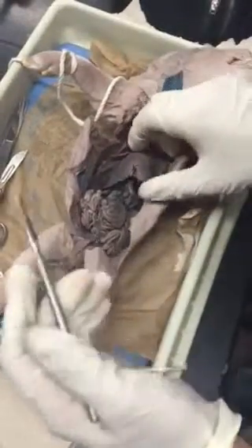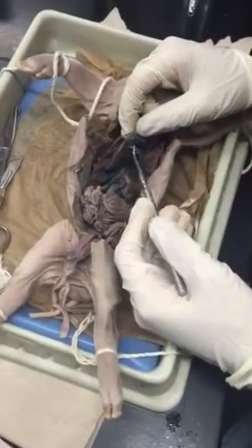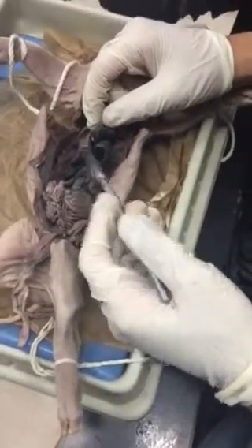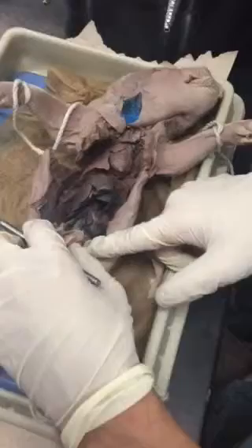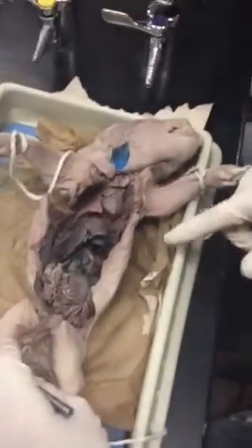Okay, so this little part right here, that's on the liver. Can anyone see that? Yes. This part was cut, but it used to be connected to this part right here, and it's called your umbilical vein.